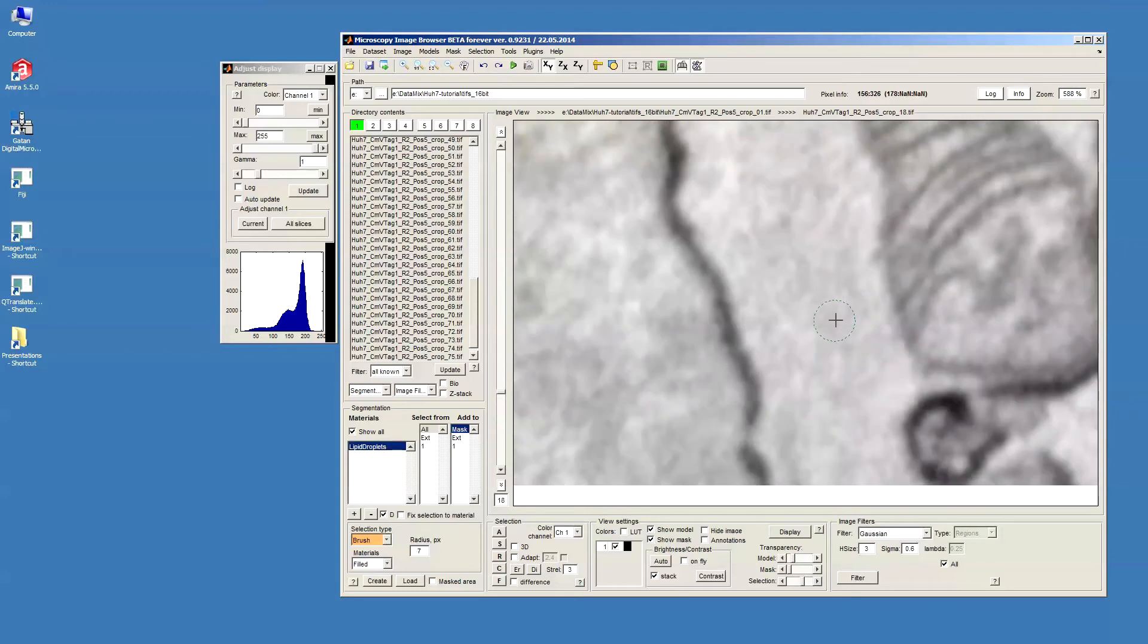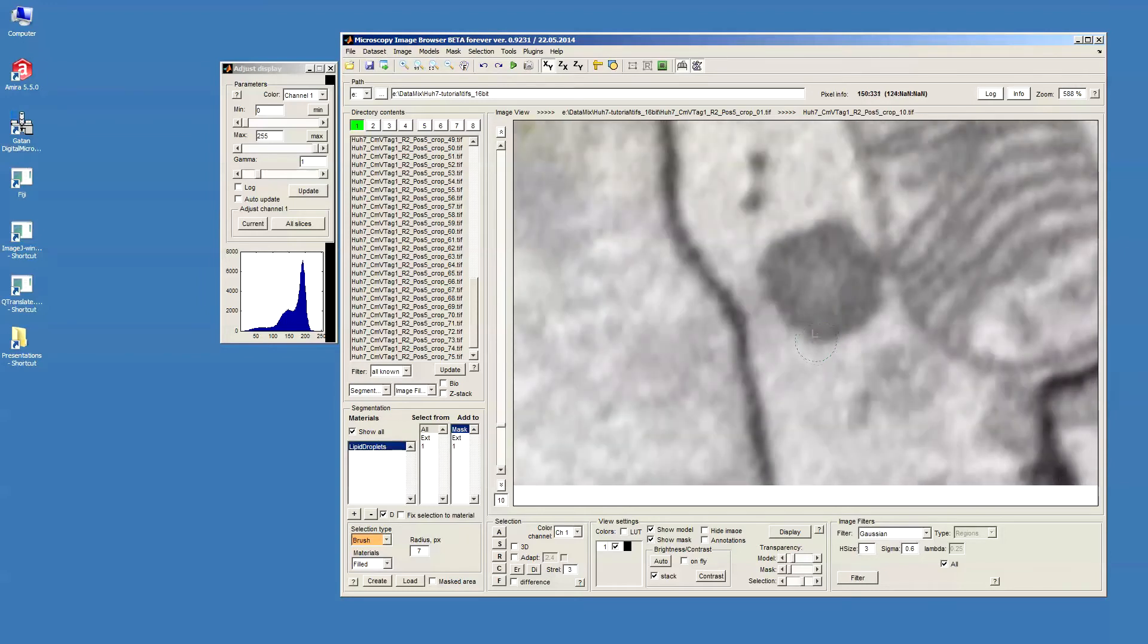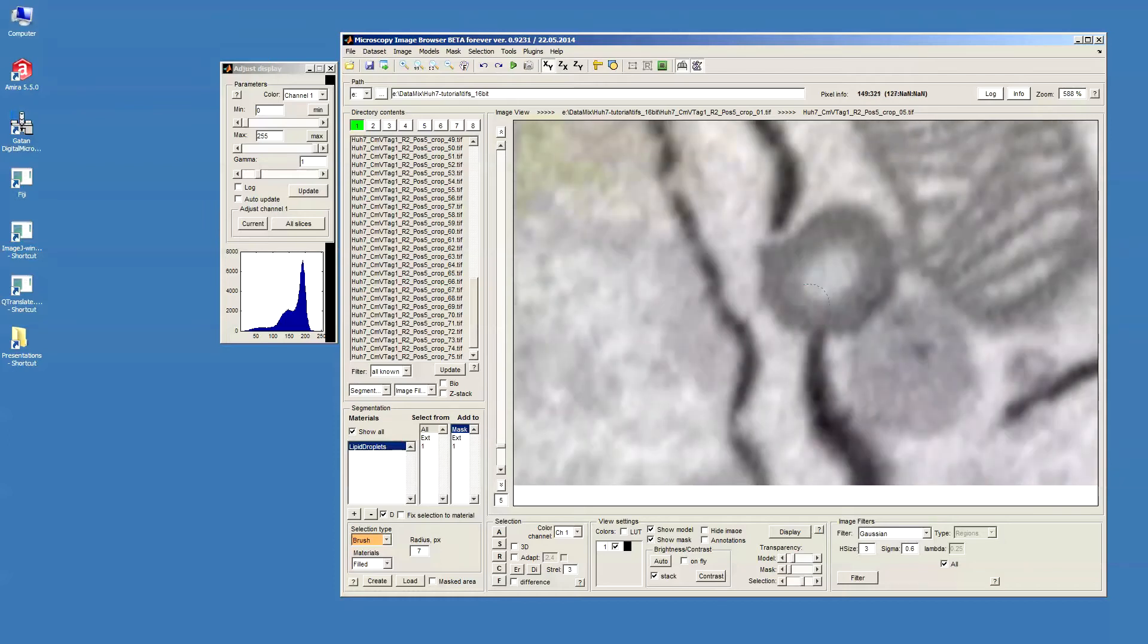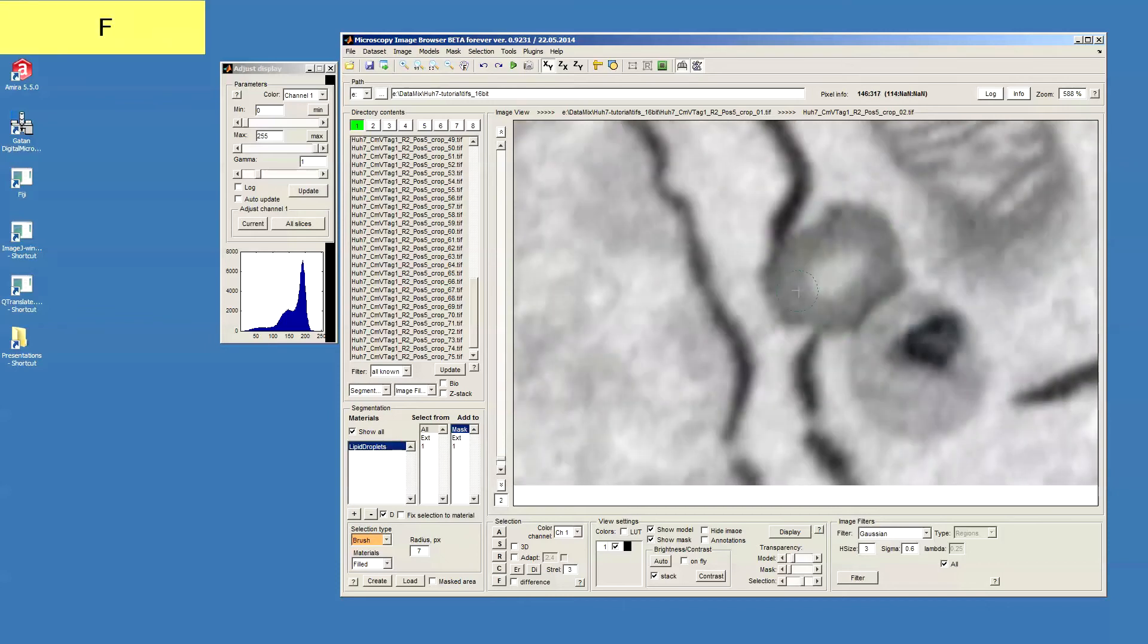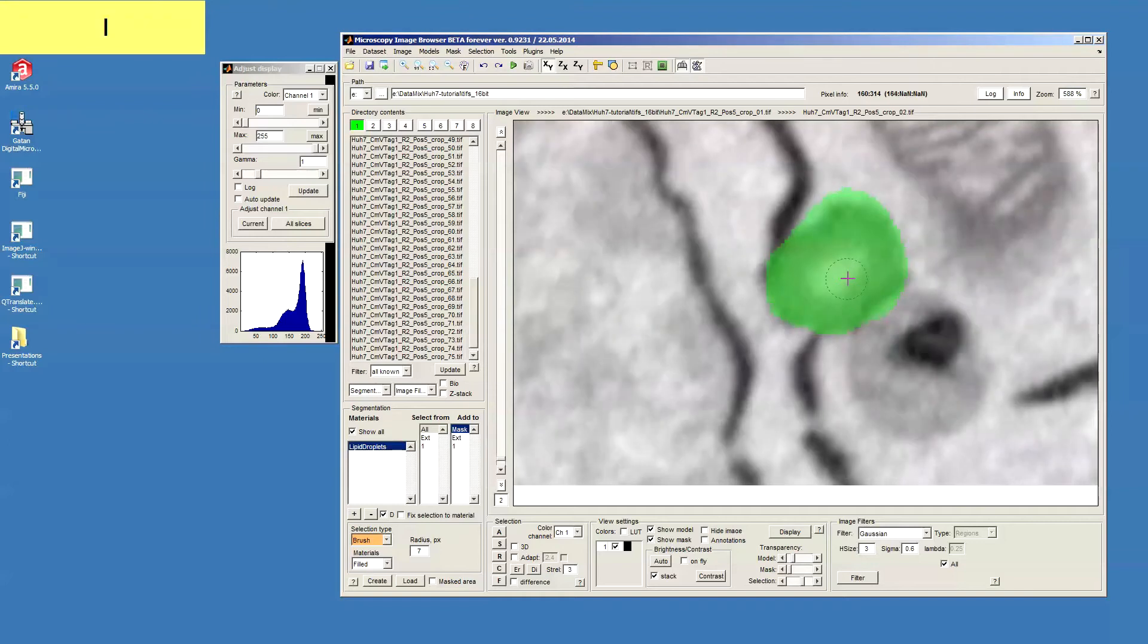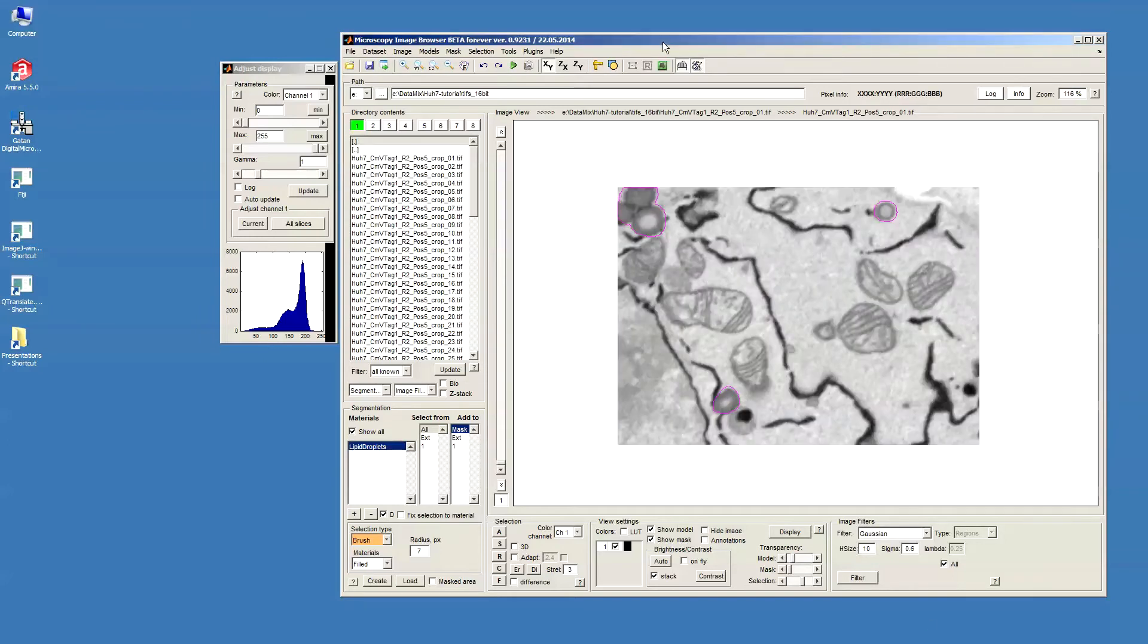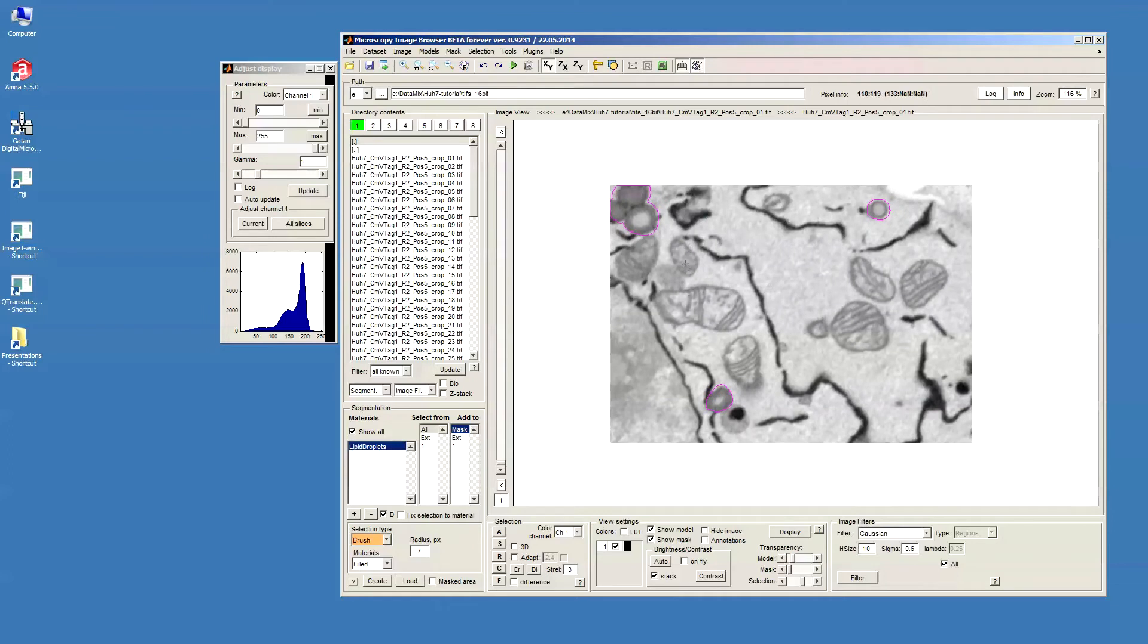For example with this one here. It's important that interpolation can only work for one object. So I can only work with one object at a time. If I would have several then the interpolation will most likely fail. Now I have this lipid droplet segmented this way.